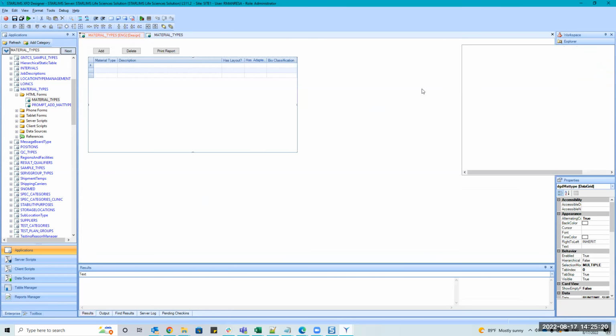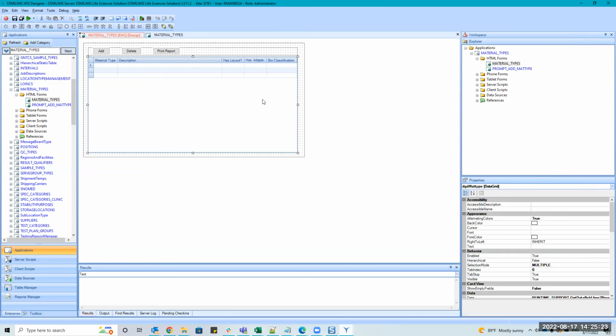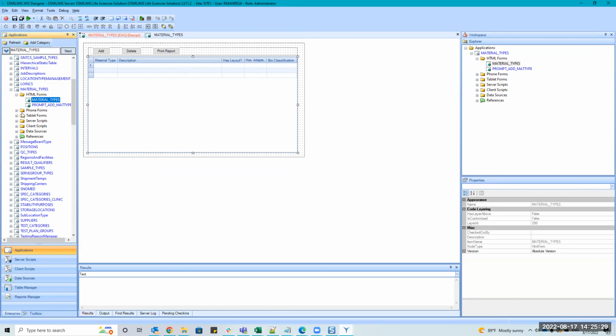So you guys got a little brief introduction with David, so I'm gonna revisit some of it, but the idea is forms. You can ignore phone stuff for now and tablet stuff. We're not touching that, but you have the HTML forms. There's also XFD forms if we have the license for it. And we can talk about XFD. We are going to talk about XFD and HTML in the PowerPoint. But basically, you have the forms, either HTML or XFD.